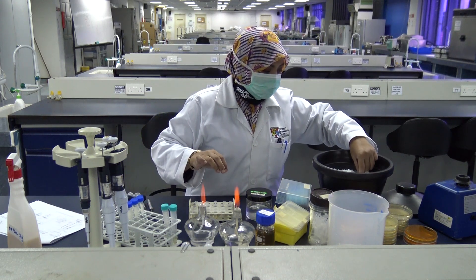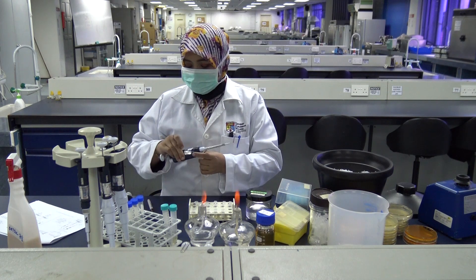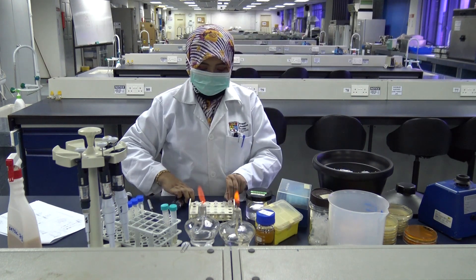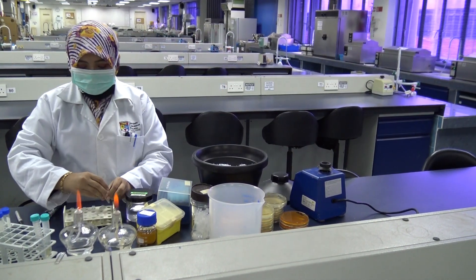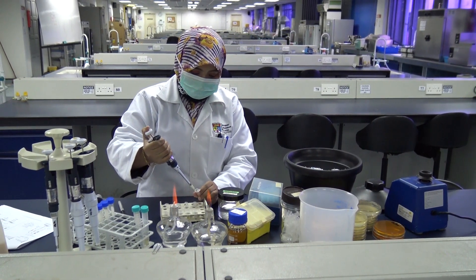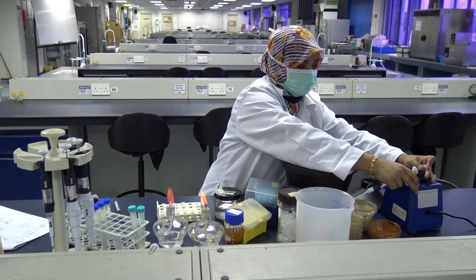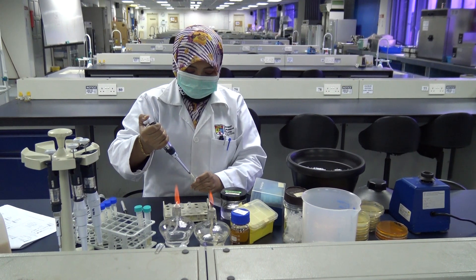Go back to your original tube of the recipient cell, E. coli 1, and take out 100 microliters and add it to the first dilution tube. This will give you your 10 to the minus 1 dilution. Vortex, then take out 100 microliters from the first tube and transfer to the second tube — this will give you your 10 to the minus 2 or 100-fold dilution. Carry on until you have completed all 5 dilutions.